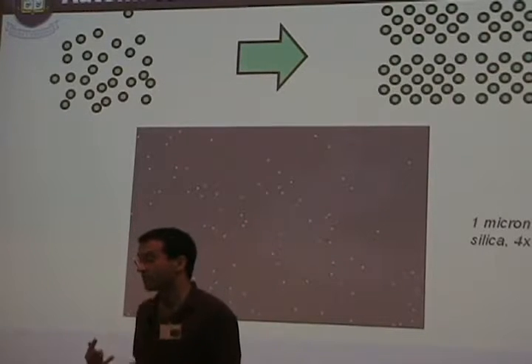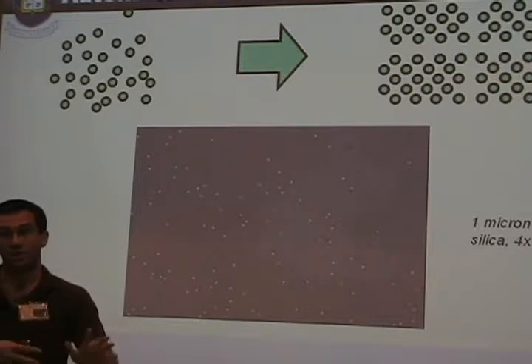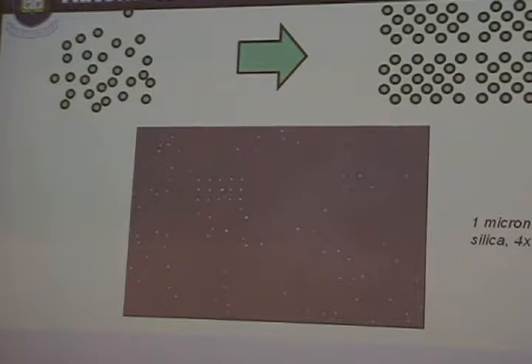So we've invested a lot of time in our lab to be able to develop closed-loop systems where a microscope and a computer can look at a sample, find objects, and then put them where you want in a predetermined pattern with no user intervention. And that's what I'm going to show here. What we do is we tell the computer, please find 25 particles. Trap them. It just traps 25 particles in the middle. And please put those 25 particles in a 5x5 grid.